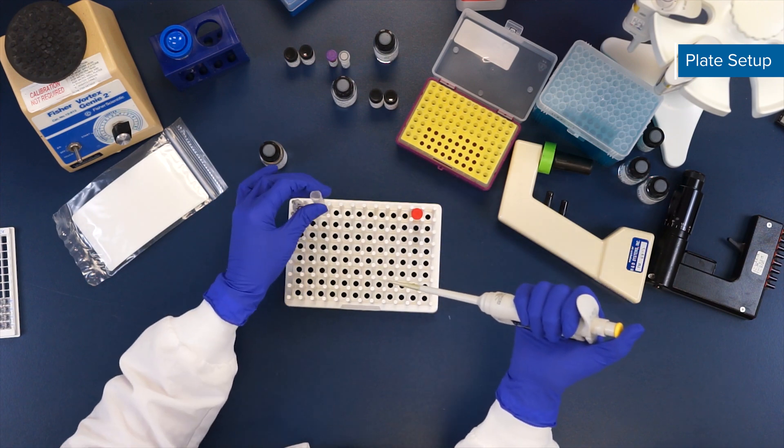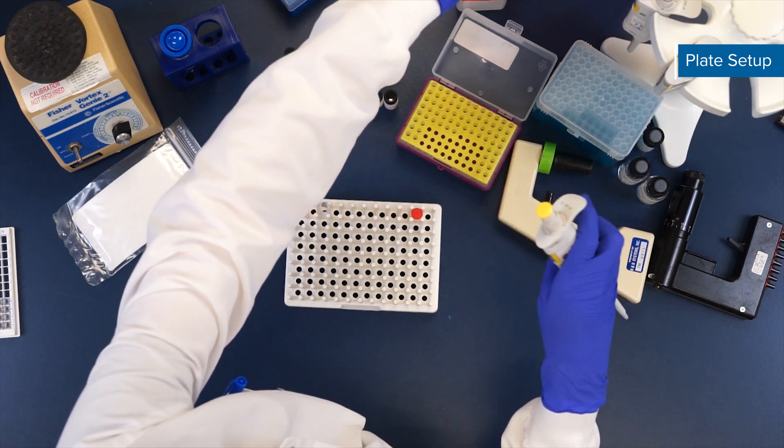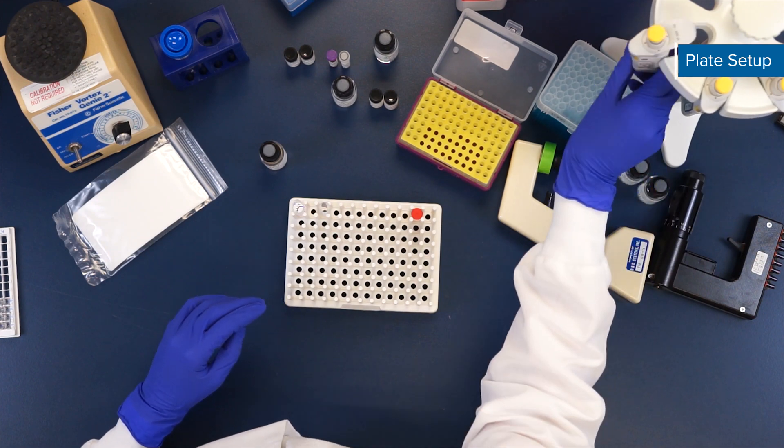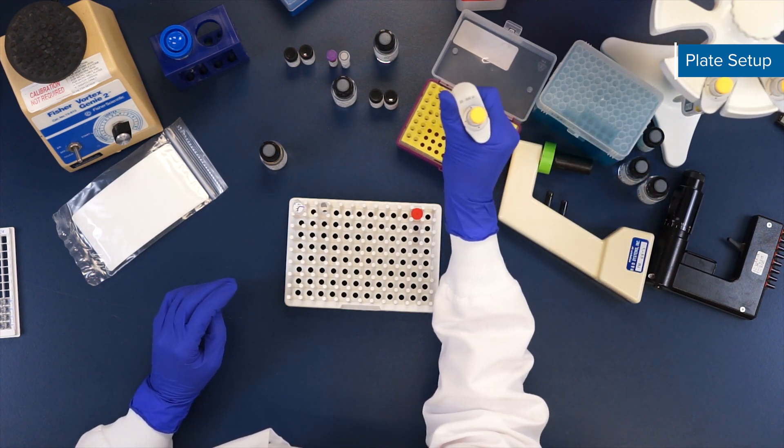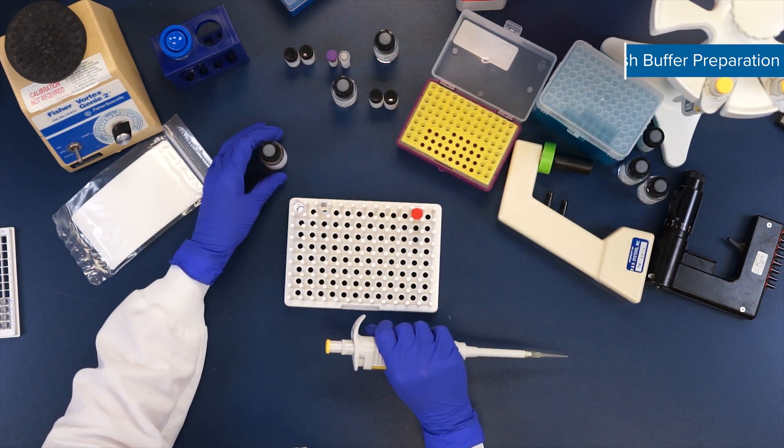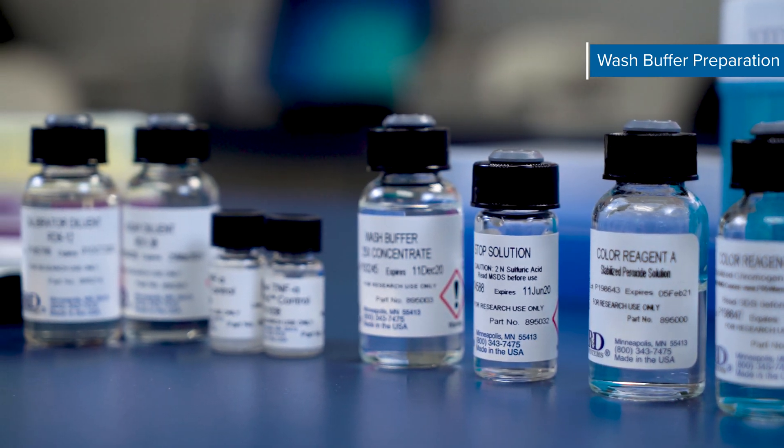Many cytokines, such as TNF-alpha shown in this video, are expressed at a very low abundance in serum and plasma from healthy individuals, and will likely fall below the standard curve. To prepare reagents, first bring all kit reagents to room temperature.